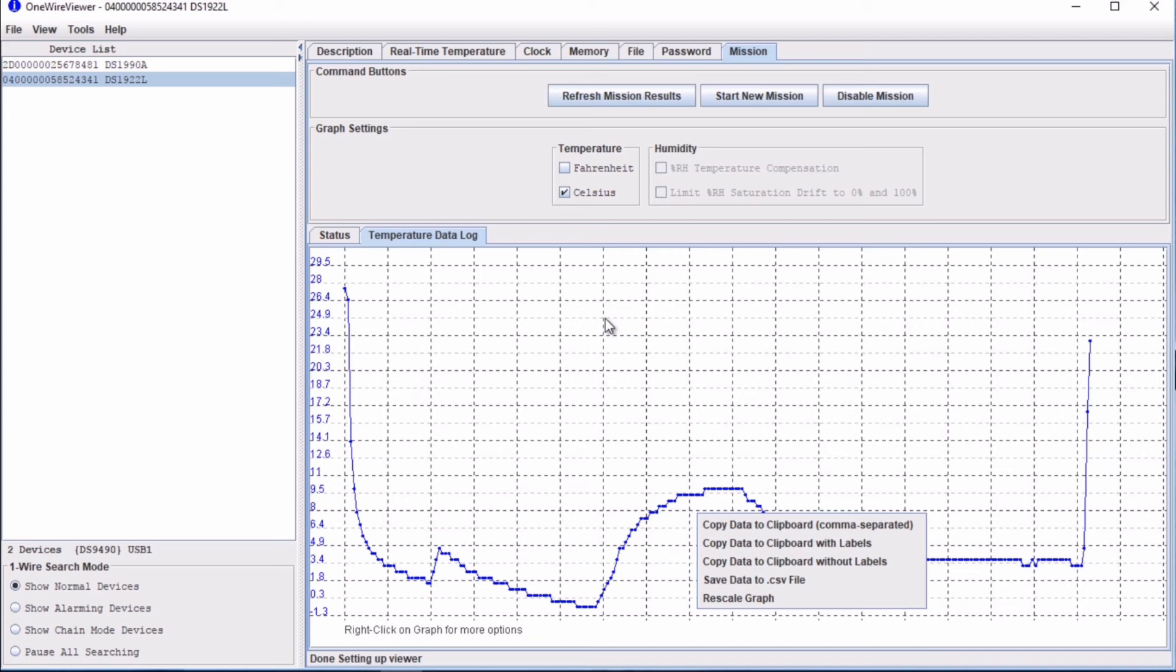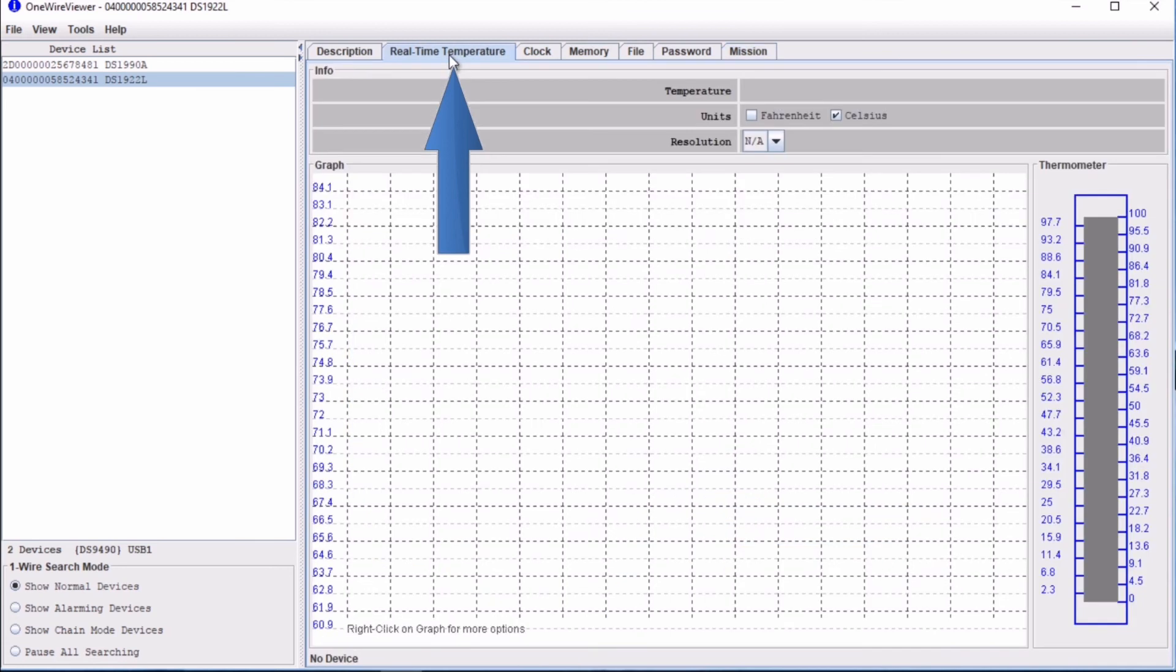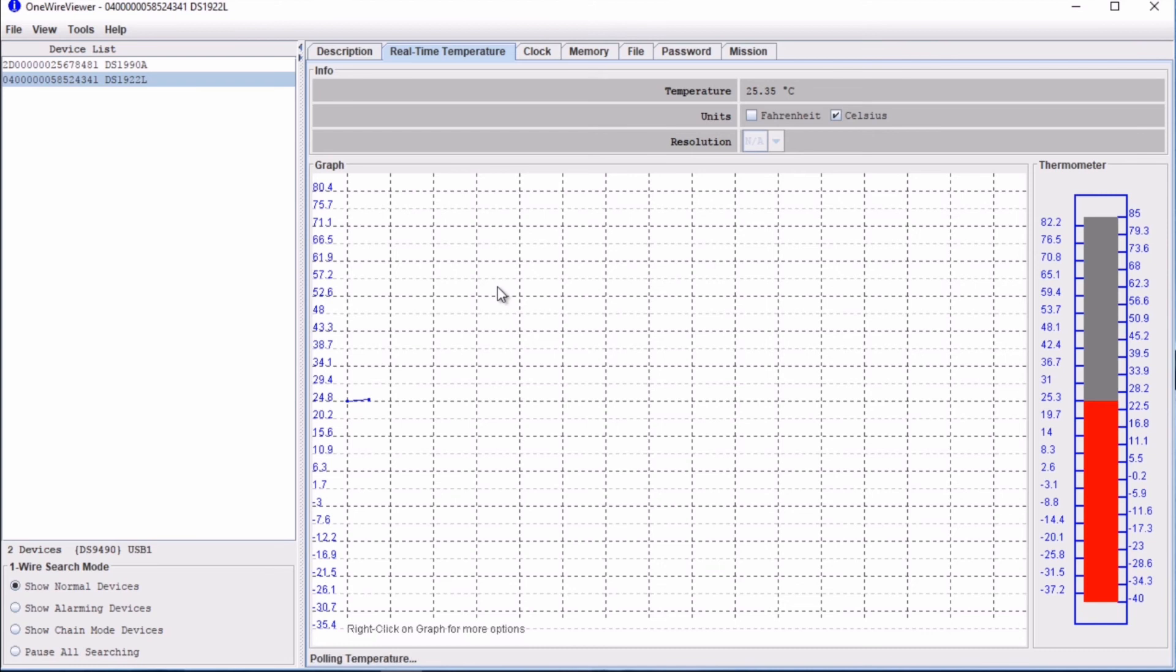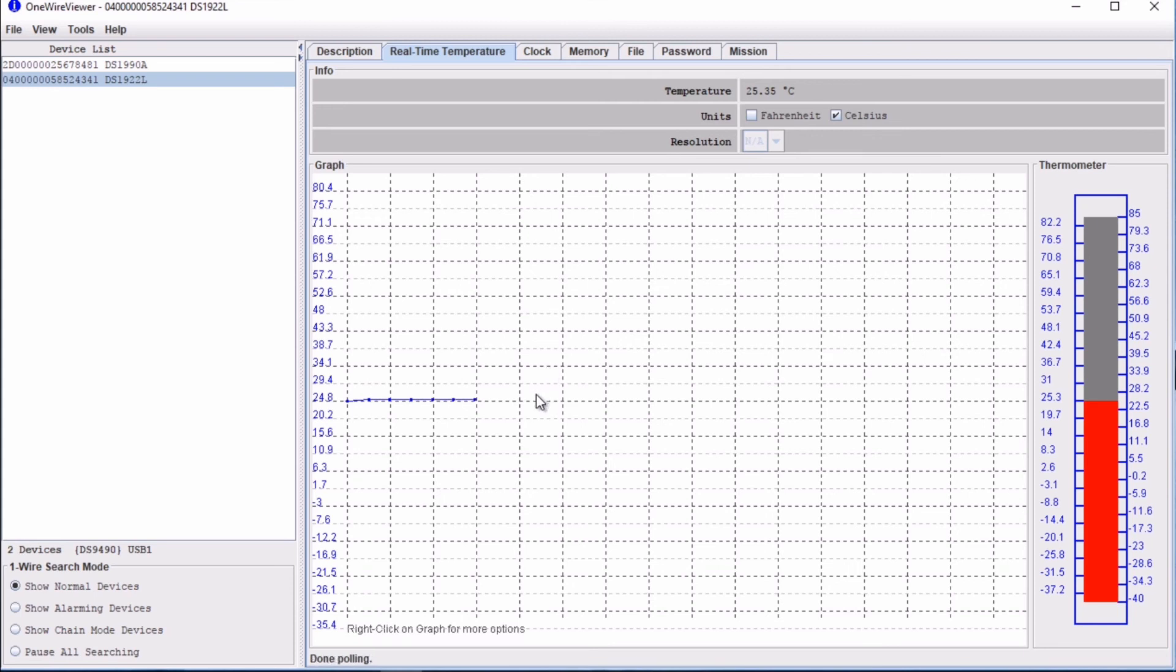This tab however is not to be confused with the real time temperature tab here. The real time temperature tab shows temperature measurements when there is no mission running. These measurements are just to display current temperature in the iButton, but they are not logged to the iButton memory. It's a cool resource to have.